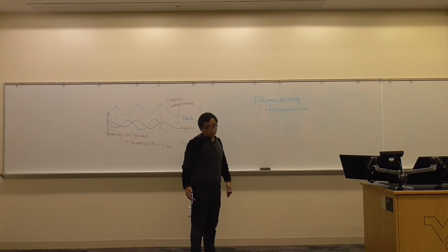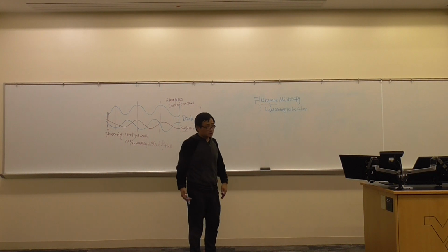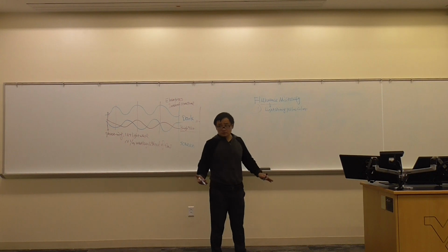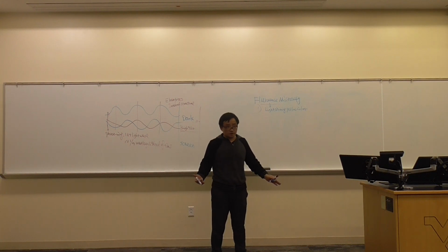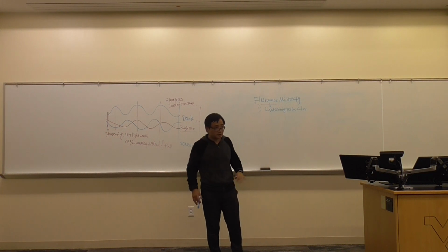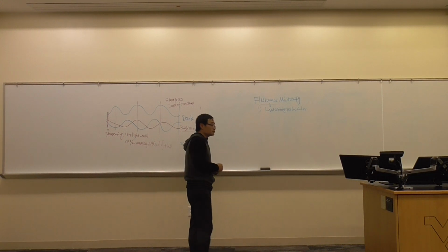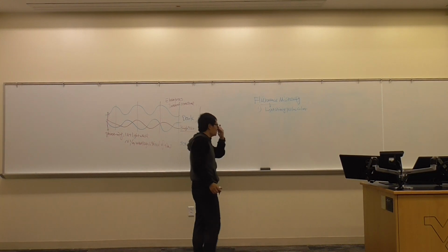Some bacteria have a natural fluorescence color. A typical one is Pseudomonas fluorescens. Pseudomonas is a spoilage bacteria. Sometimes we can evaluate sanitation impacts. So, you use some tool, do a scan, and if you see the fluorescence color, that's not good. That means Pseudomonas is there. So fluorescence is very useful. It's a light shining yellow color.